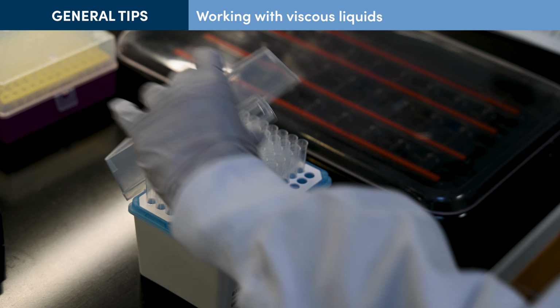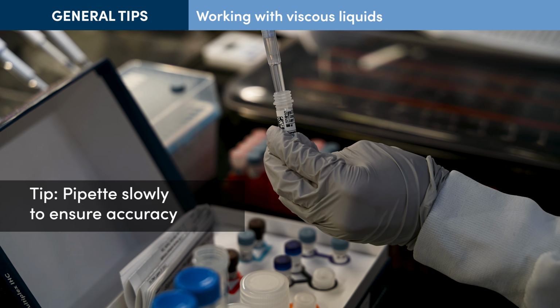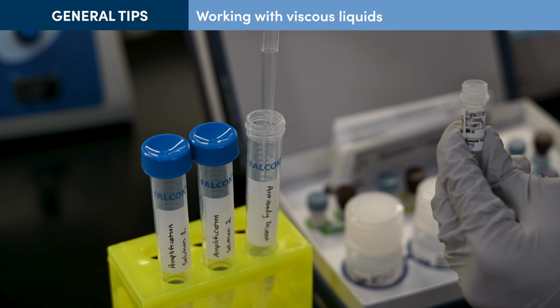Keep your pipette tip submerged in the buffer for up to 30 seconds to ensure the volume is accurate and to avoid accidentally drawing up air bubbles into the pipette. When dispensing, also allow extra time to minimize retention of viscous liquid in the pipette tip and to confirm as much solution is transferred as possible. Pause at the bottom, then depress the barrel further. Use 15 mL conical tubes for combining components and incubate with end-over-end rotation for 20 minutes at room temperature to ensure complete mixing.